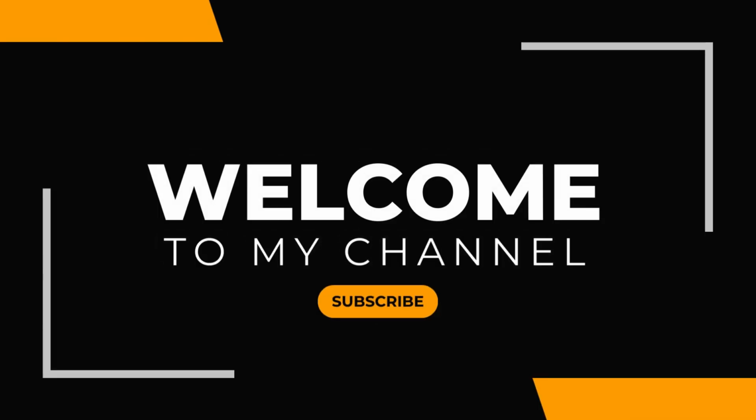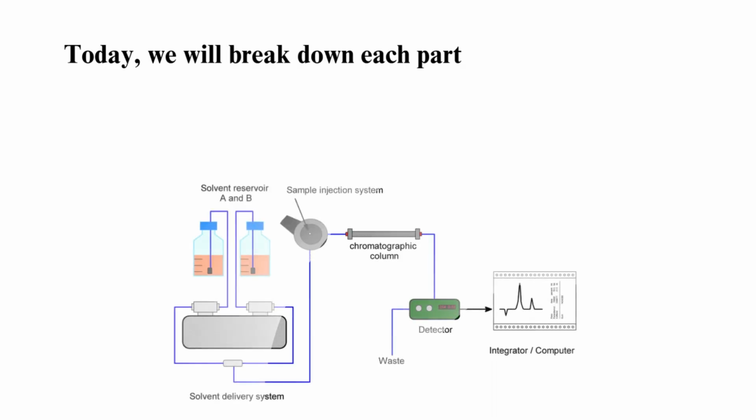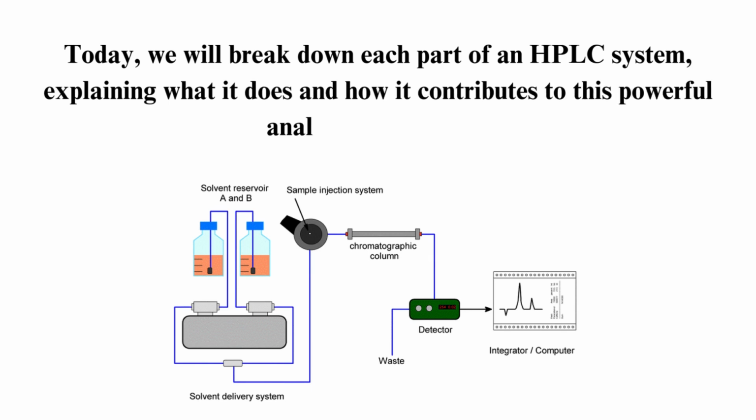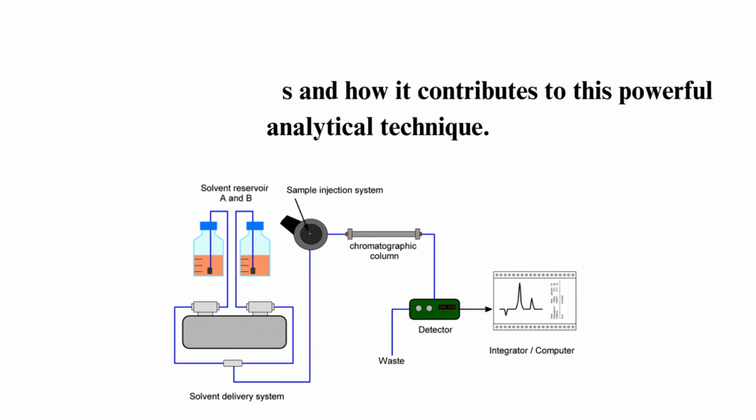Welcome back to the channel. Today, we will break down each part of an HPLC system, explaining what it does and how it contributes to this powerful analytical technique.